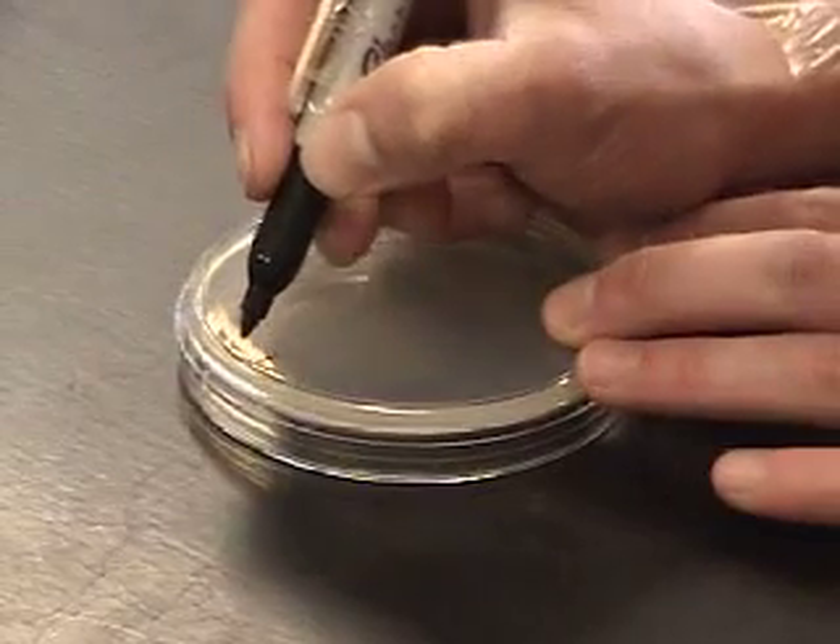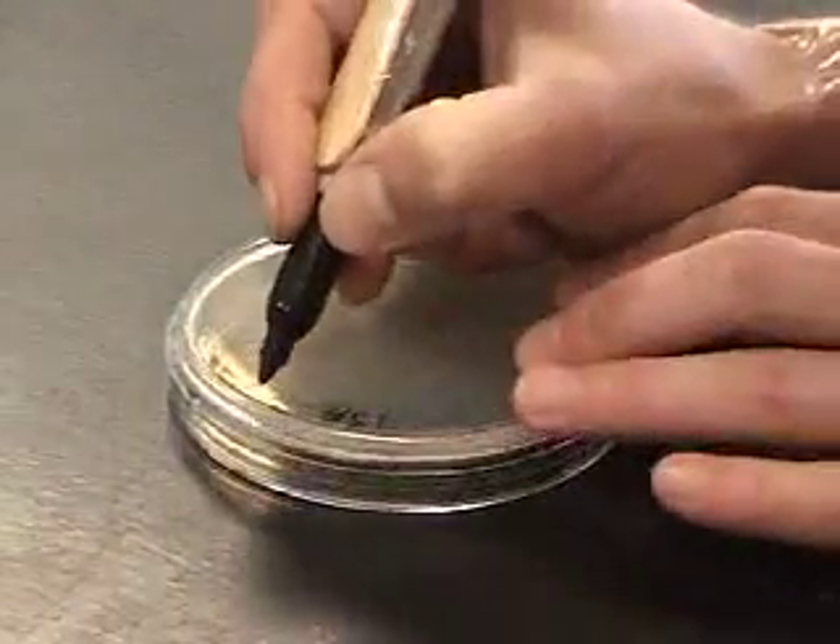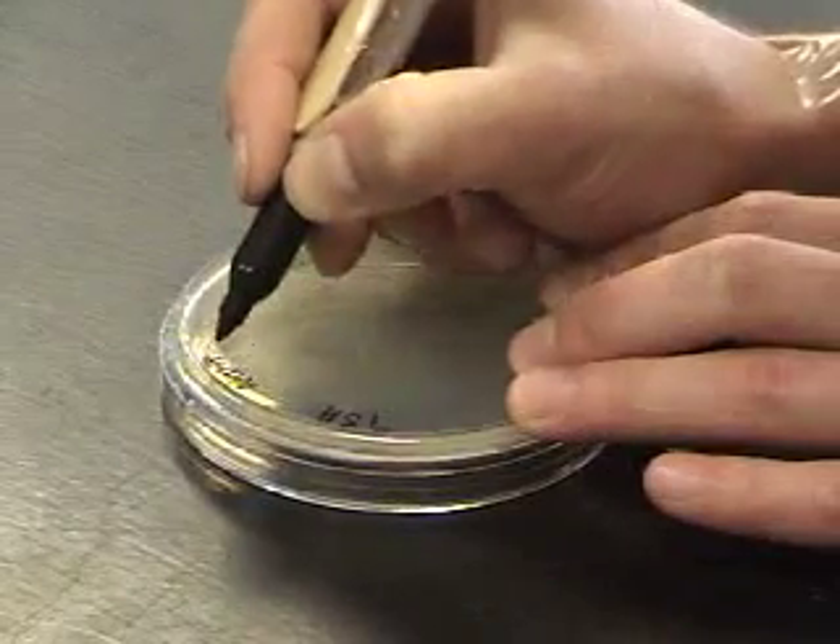Microorganisms are almost everywhere we look. In order to demonstrate that in this procedure, we're going to do three different things. To start with, you'll need to label two different TSA plates.